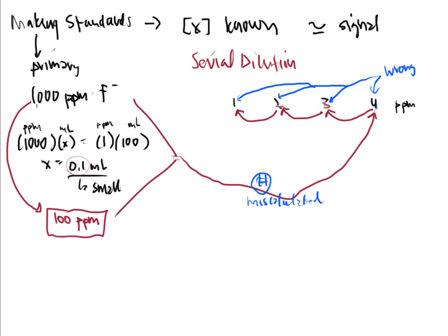And sometimes you won't be able to pick up on them. And this is why. Because when you run those standards and you messed up on the original, and that original was miscalculated, but you used that original to make everything else, and everything else from that point on was made correctly. Math-wise, it was done correctly. But because that number 4 was wrong, and let's say that it's not really a 4 part per million, but a 40 part per million, you made a mistake. Whoops. But you don't know that. Well, instead of a 3, a 2, and a 1, this is a 30, a 20, and a 10.